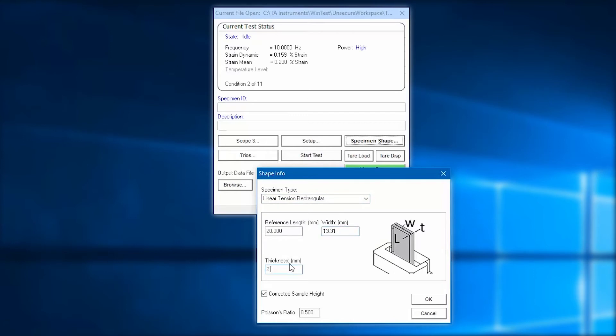Now, instead of trying to precisely measure the specimen length after I installed the sample, I click corrected sample height. This changes the length here to reference length. This is where I enter the height of my gauge block used when taring my displacement channel.